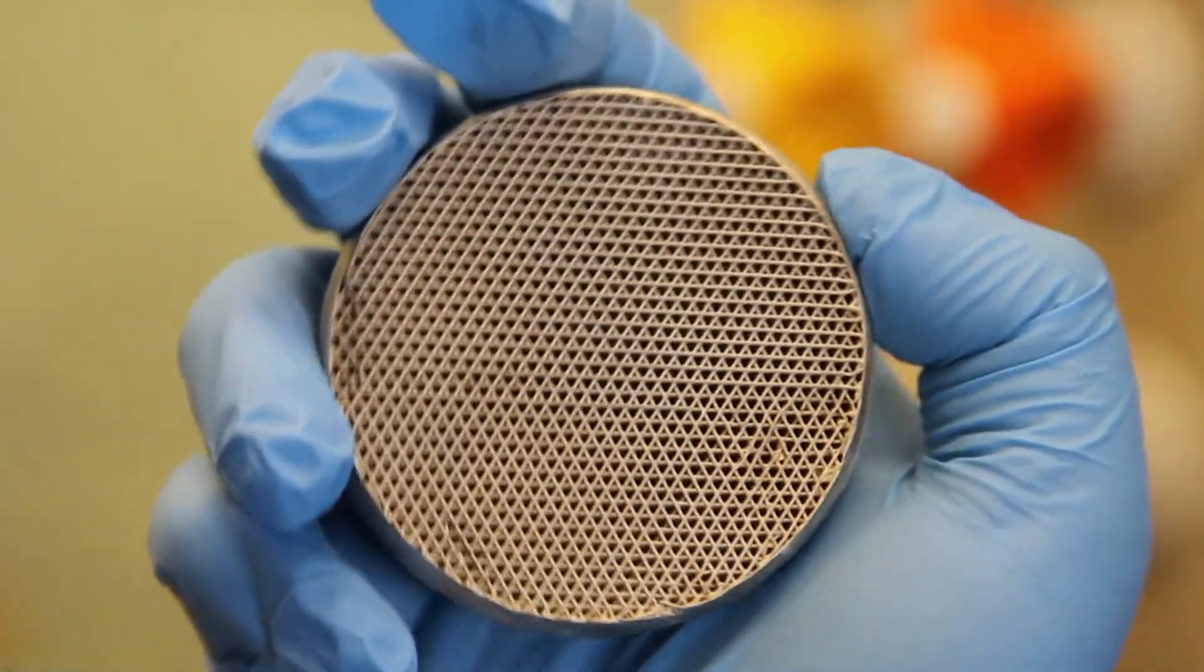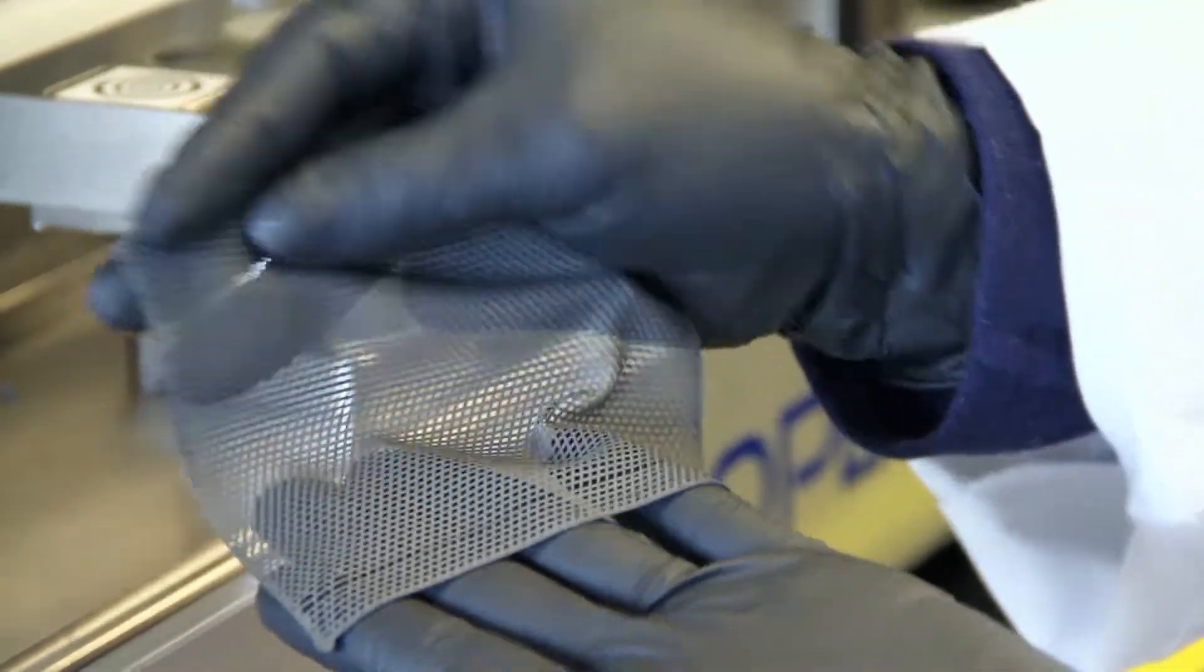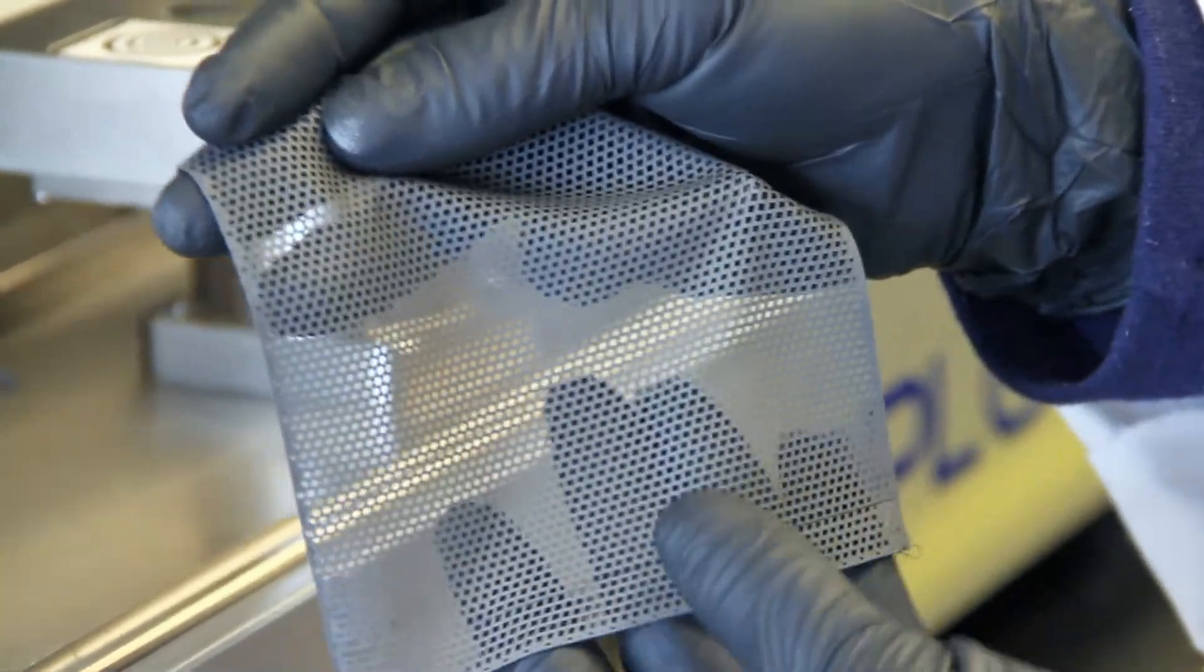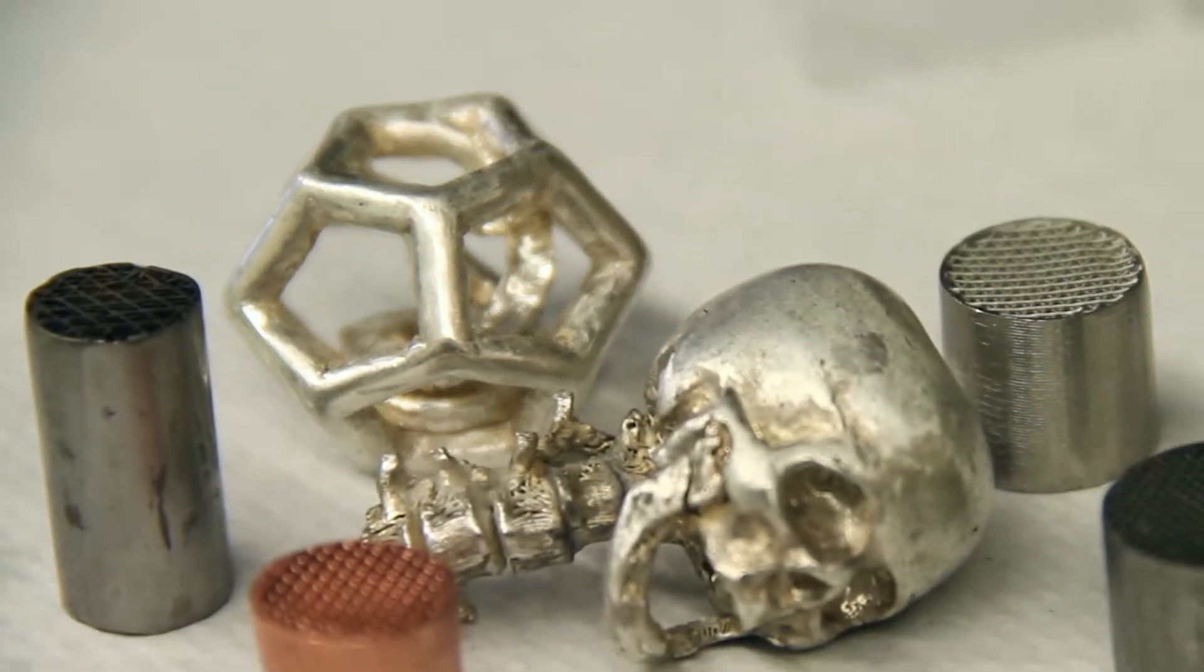The metal work is also quite interesting. Similar to the graphene work, we're making a 3D printable metal ink made of metal particles. Those metal particles can be elemental, like iron, aluminum, or nickel.